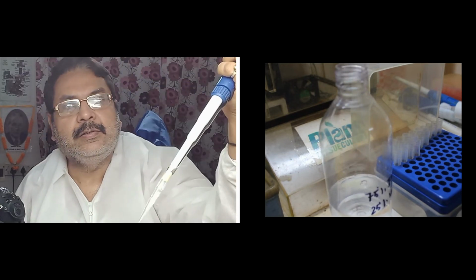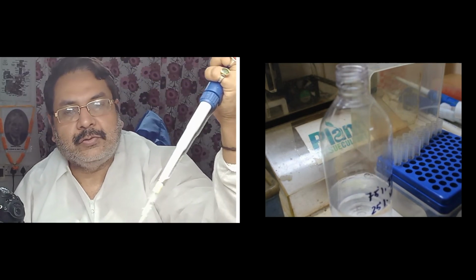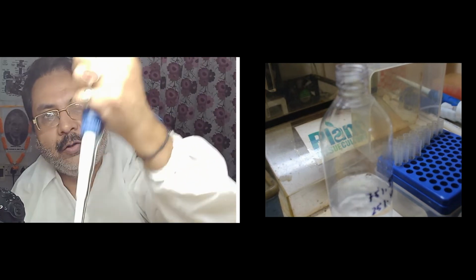Mouth of the tip. Just push it. Put the mouth of the tip inside and slowly release the plunger. And the whole liquid is inside. So this is how to use the auto pipette.